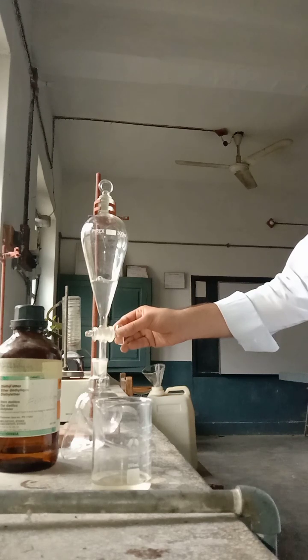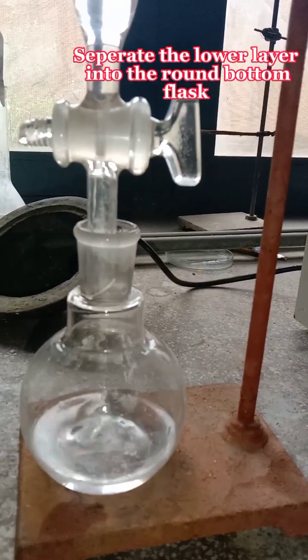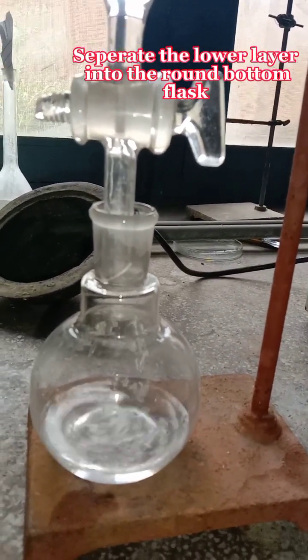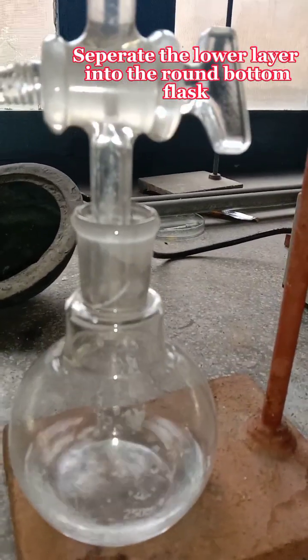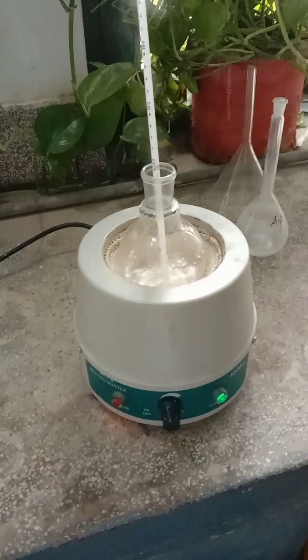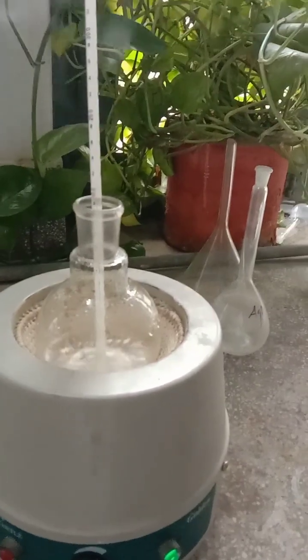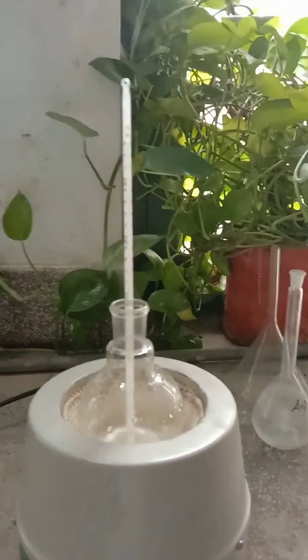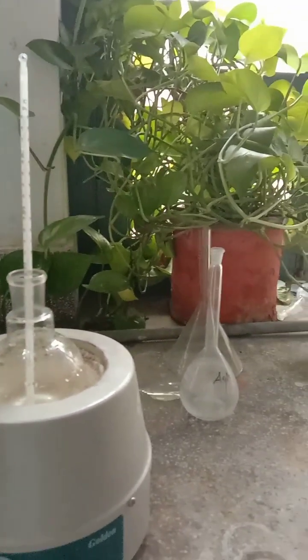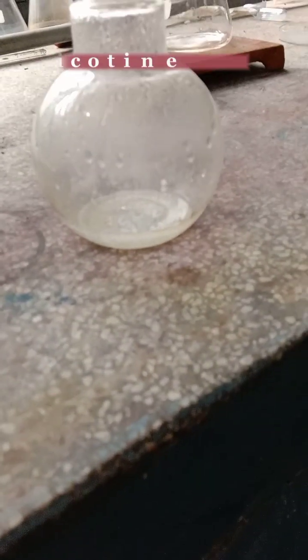Now we separate the lower layer into a round bottom flask. You can see here the separation of the lower layer in the separating flask being transferred into the round bottom flask.